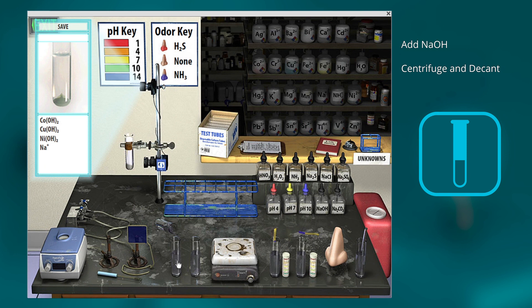So I'll centrifuge, decant. Now we're left with the three hydroxides.